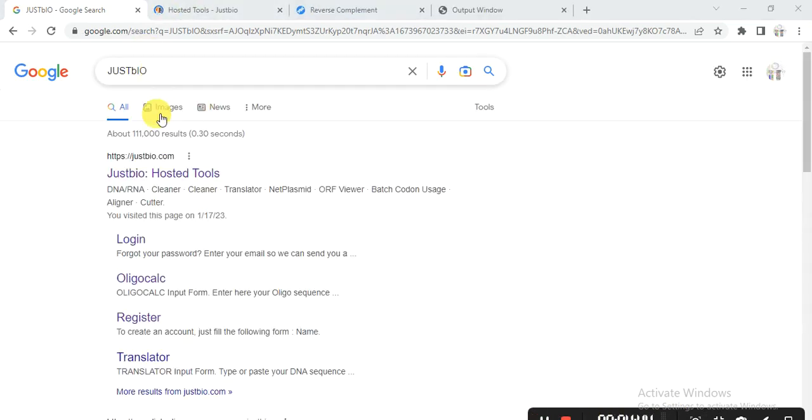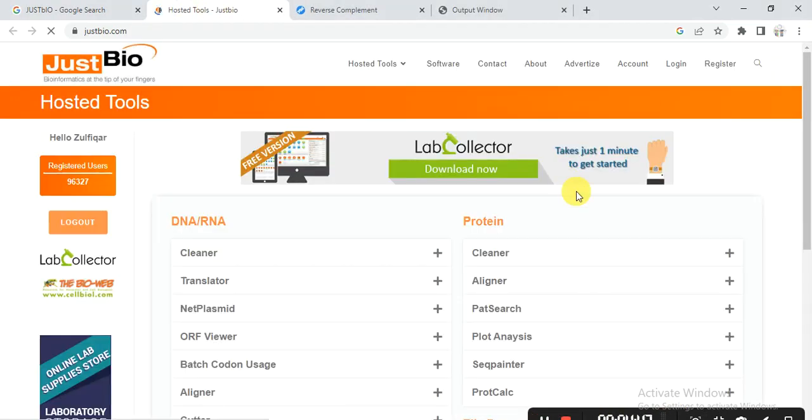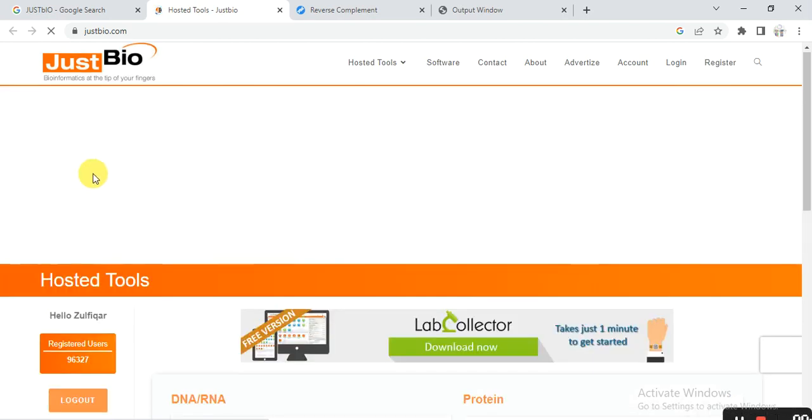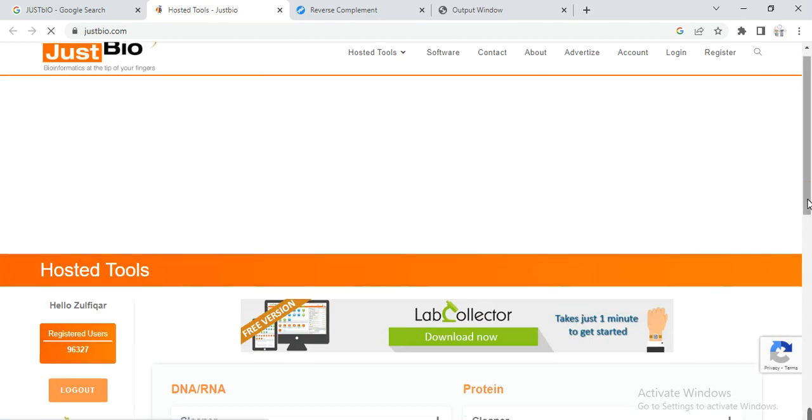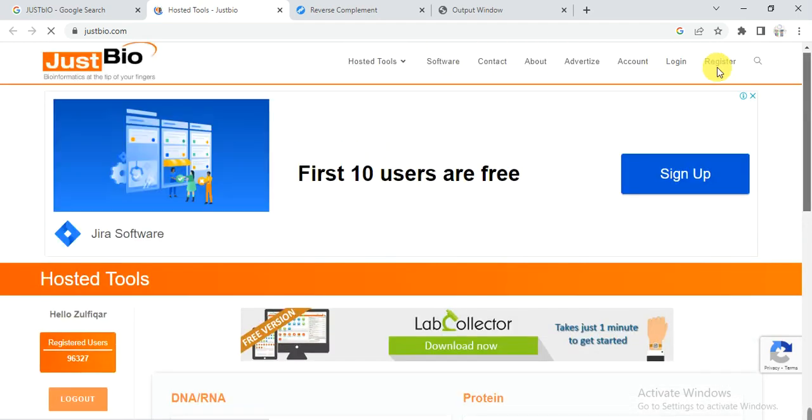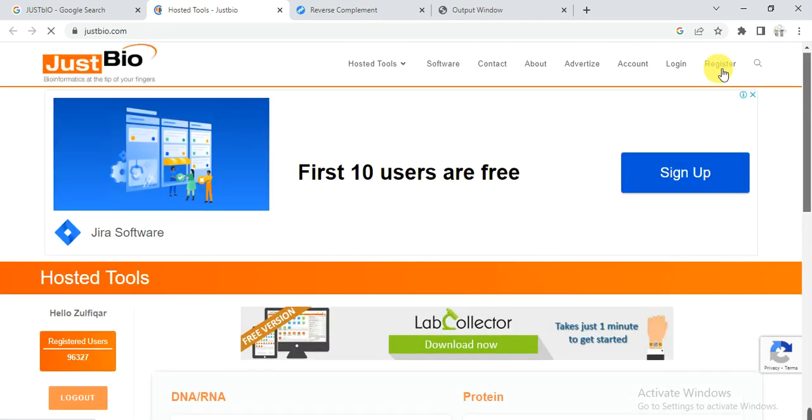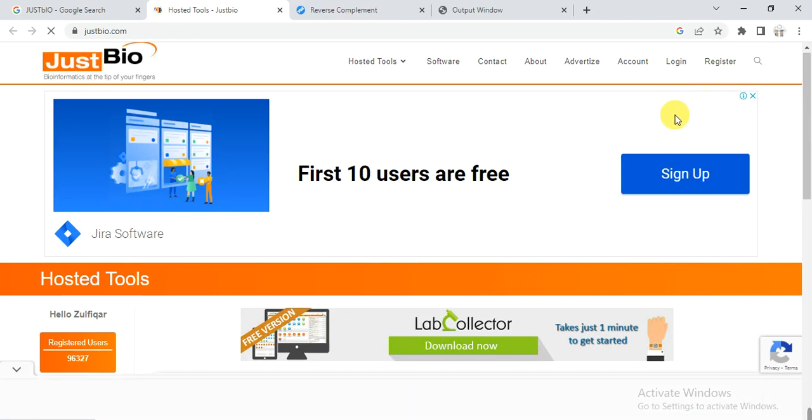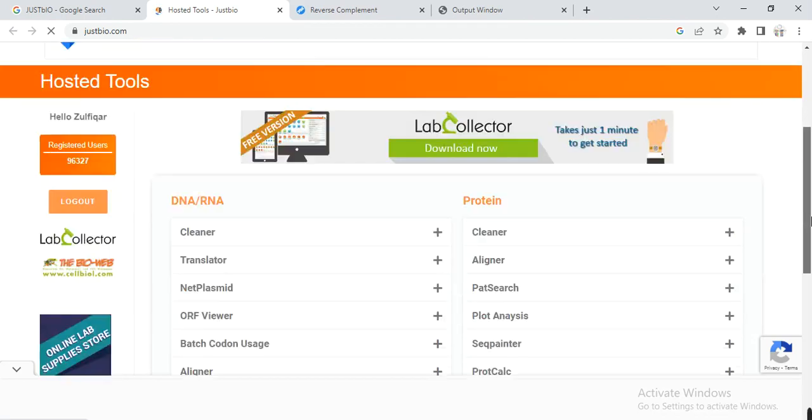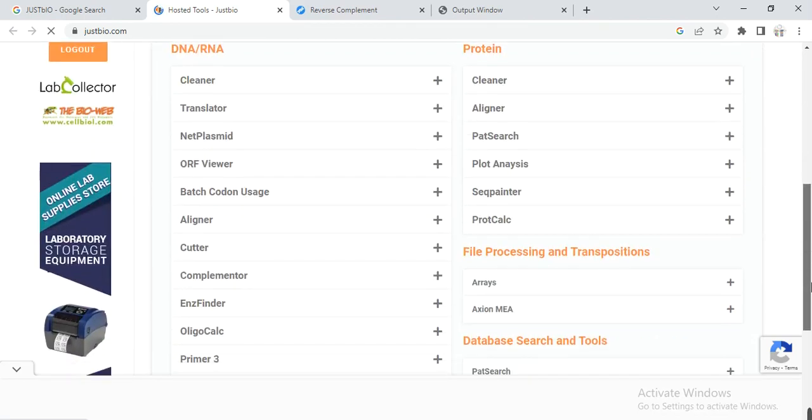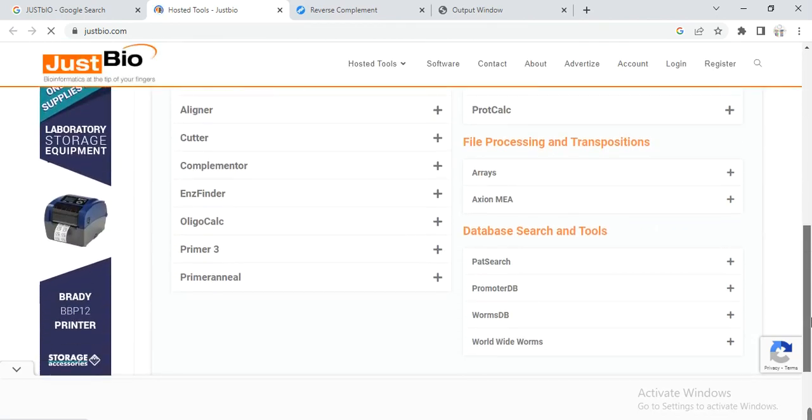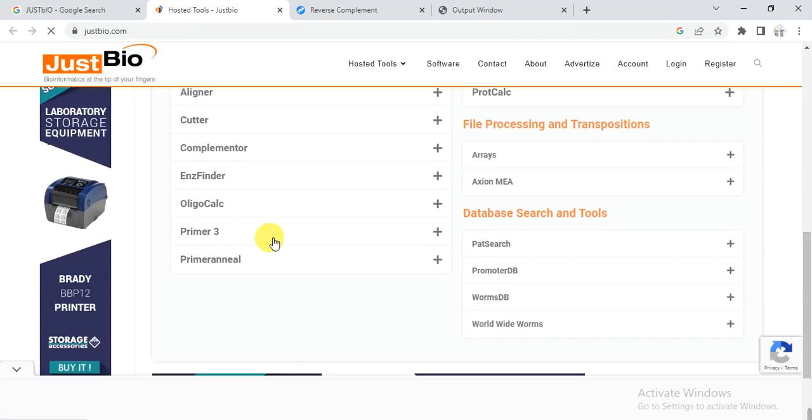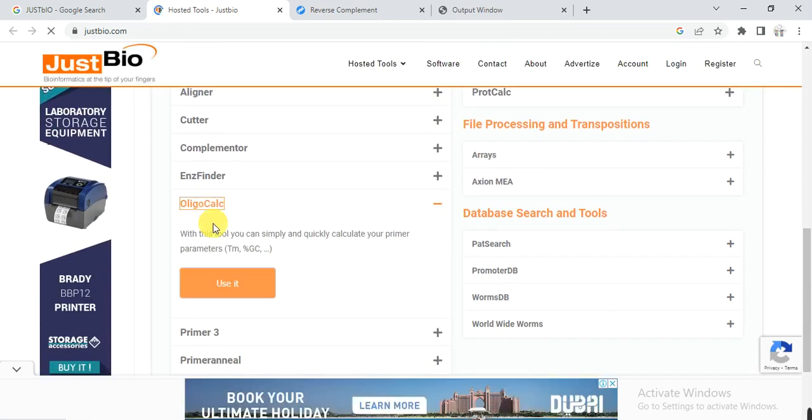Open that link and you will find lot of tools, but first you need to register. If it is already available, you need to click on register, then give your data and email. Then on email they will send you the username and password. Then through that username and password you will log on it. And then you need to go to here, that is oligo calc, and then use it. Click on use it.